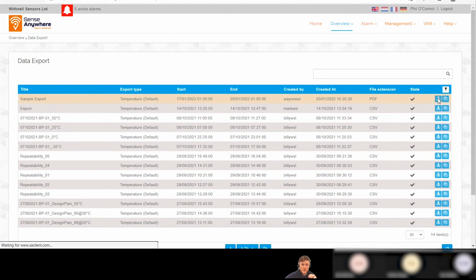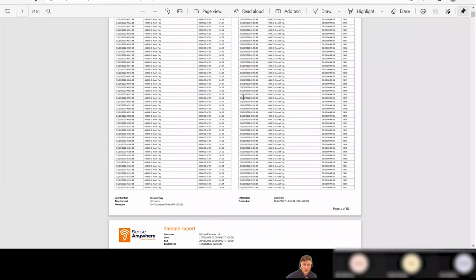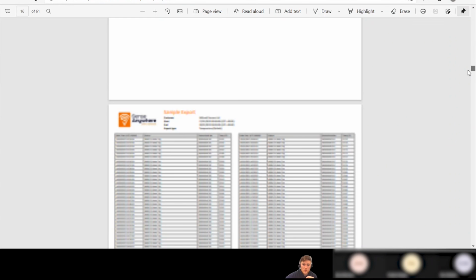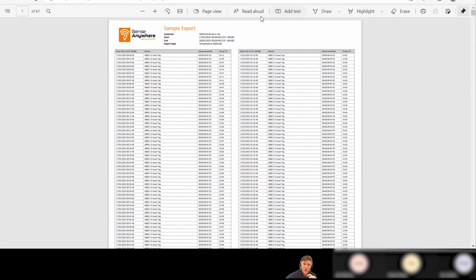Hopefully it is just an internal one. If it's not, I'm going to have to quickly turn off the screen. But yes, this would be the sample report of one of our loggers, or a few of our loggers. As you can see here, it's a more in-depth structured thing. Basically, this is what the time was, this is what the temperature was, and you can have 1 million samples per report. So it's very extensive, but it's not as clean cut as the mapping report, and it's not designed around mapping. I'll send you an email with everything on there, just so you can see.